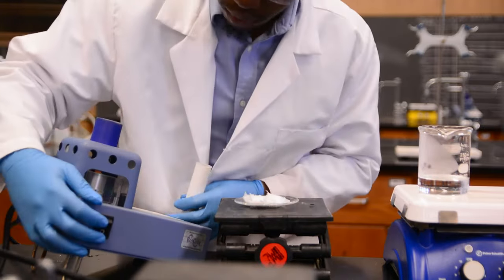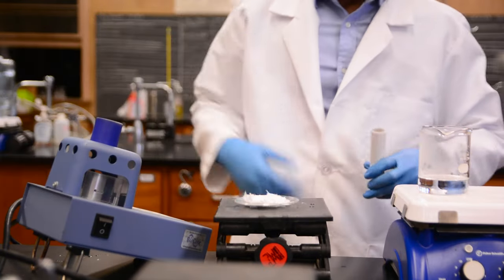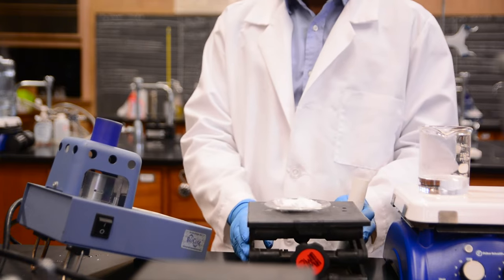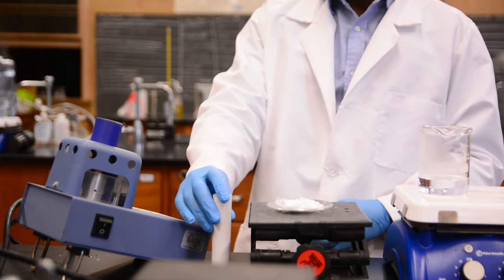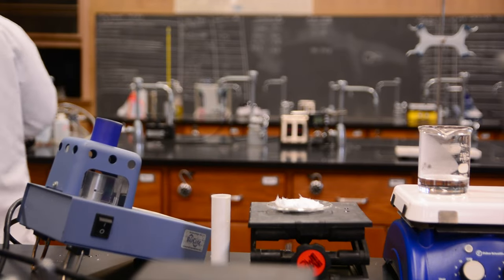Now the point of this technique was to get pure crystals. The best way to test the purity of a solid is by measuring its melting point and comparing it to the original impure mixture, as well as the literature value for the product.